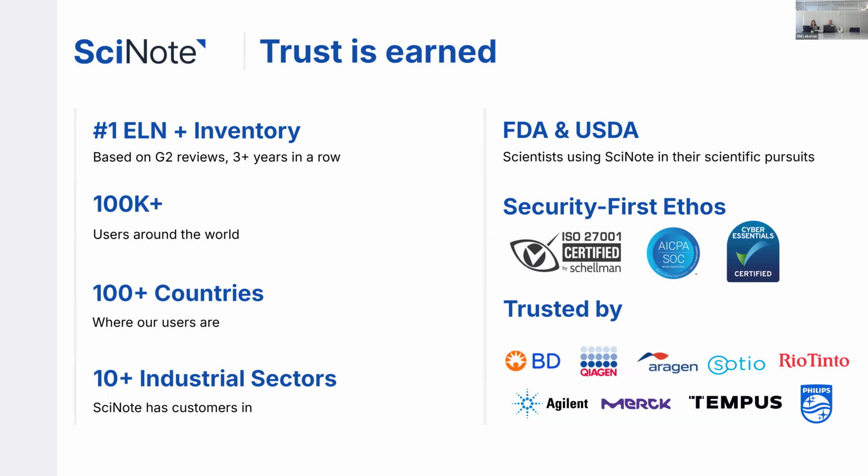And what we're very proud of is that we do support FDA and USDA. I'm sure all our customers are already aware of this, but for everyone who is not, we do have a security first ethos, and you can see some of our certifications. We also have SOC 2 Type 2, which I don't think I added, but you should be aware of this, and some of our customers in the bottom right corner.